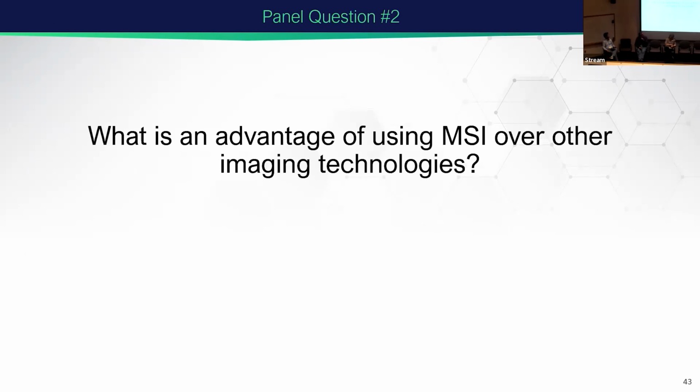So our next question for the panel is a directed question. After this, we'll go through a couple of these, then we'll open it up to the audience. You can ask whatever you want of the panelists within reason. So right now, question number 2 to each of you, and we'll go in the same order from Kristen to John to Youngjin. What do you see as a major advantage of using mass spectrometry imaging over other imaging technologies, whether this be just normal microscopy or immunohistochemistry or anything in between?